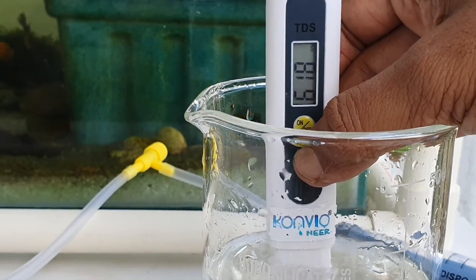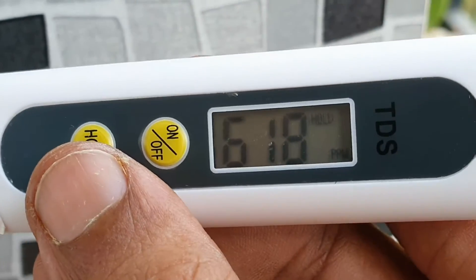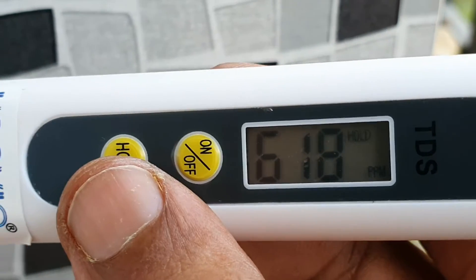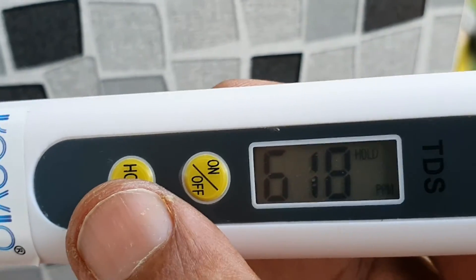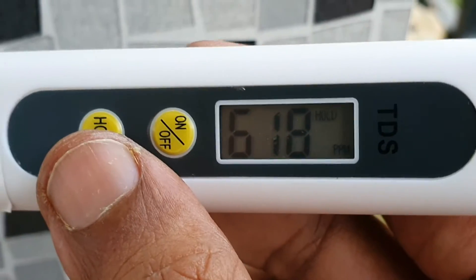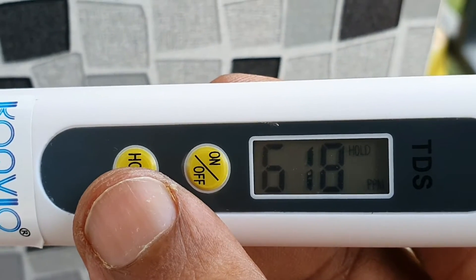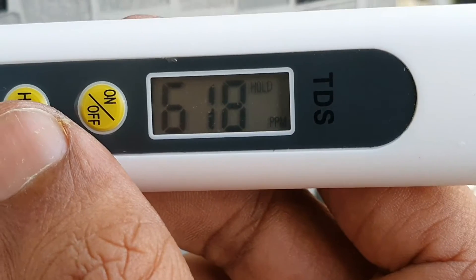It has a higher PPM than the tap water, so there are some corrective measures that might be required. I can see that I have close to 618 PPM from the aquarium. I had around 549 for my tap water and less than 69 for my filtered water. So something is not right here.